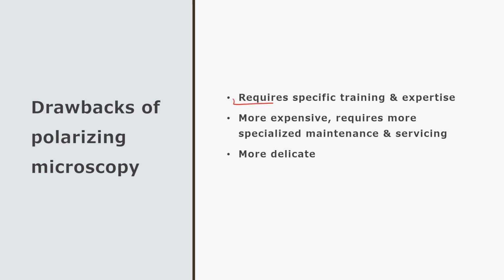And of course, the personnel using the microscope within your department need to be specifically trained and have a good background of knowledge about how light works and how different minerals work, about crystallization, to be able to really understand the results that you get from polarizing microscopy.